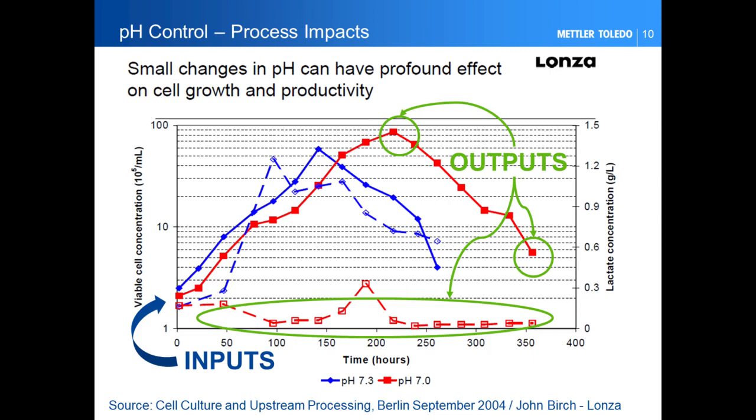So to optimize pH management, it's essential to better manage CO2 accumulation in culture media. In this case, whatever the origin of the pH difference of 0.3 pH unit from inoculation, it will impact the three major outputs of the process. The design of the pH sensor will influence the overall performances in line, including post-sterilization, the eventual adjustment required.